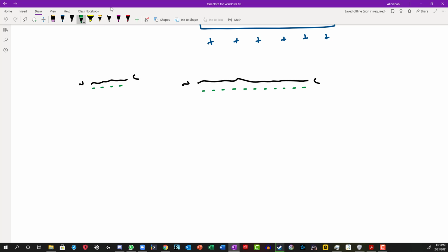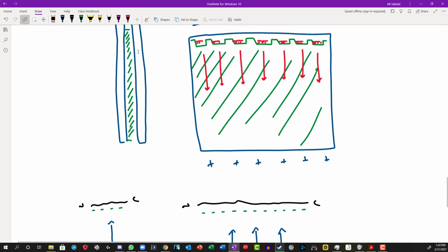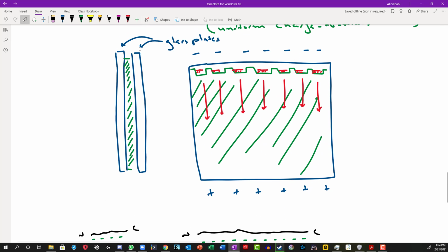Polyacrylamide gel is a gel, so it's a viscous solution where there is more resistance being applied to the bigger one than it is to the smaller one. So the bigger one will have a hard time getting through the gel than the smaller one. So the smaller proteins will run faster through the gel, whereas the larger proteins will run slower. So the proteins will all be separated based on size, with the larger proteins being on top and the smaller proteins running faster and getting to the bottom.